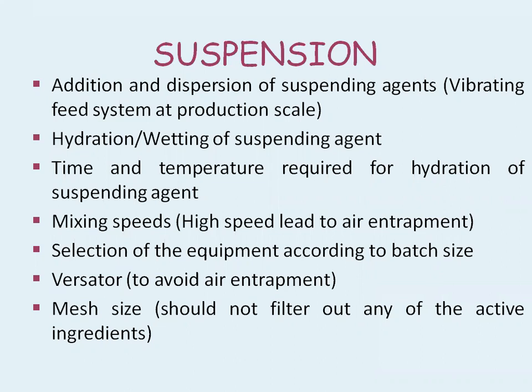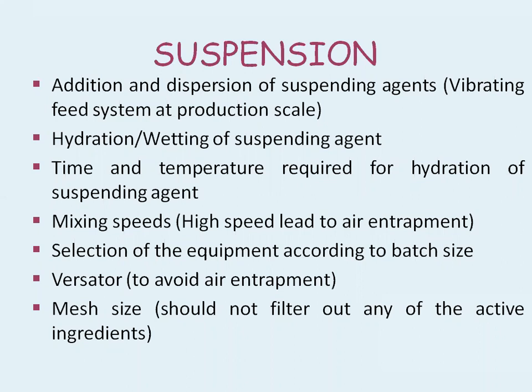This is a very important step in a liquid suspension, because if air is entrapped, it will affect the quality of your formulation. If your drug is susceptible to oxidation or some degradation through the atmosphere, there you will get a problem. Then the mesh size means, when you are using the filtration assembly, which mesh size you are using. All these are very important points we have to consider when we talk about the formulation of this suspension on a large scale.